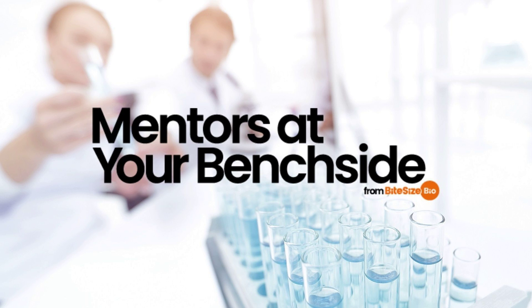This two-step assay first makes use of the Biuret reaction, in which the protein backbone chelates copper-2 ions and reduces them to copper-1 ions. In the second step, the copper-1 ions react with BCA to form a purple-coloured product that absorbs at 562 nanometers. This entire process takes about 15 to 30 minutes at 37 degrees centigrade.